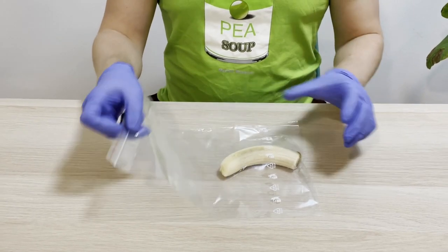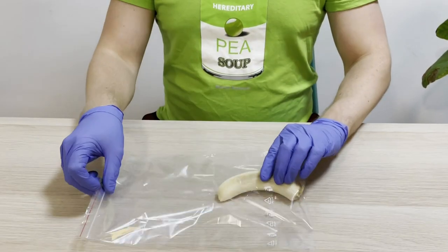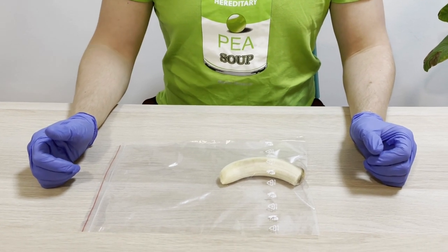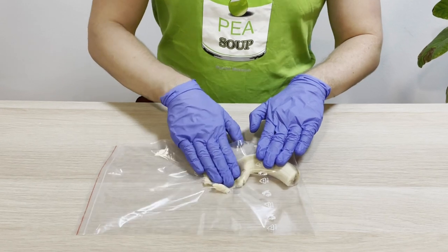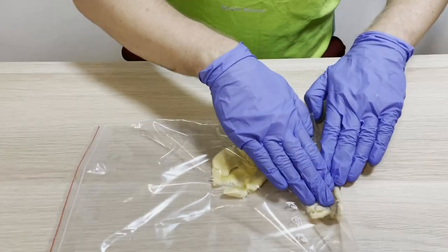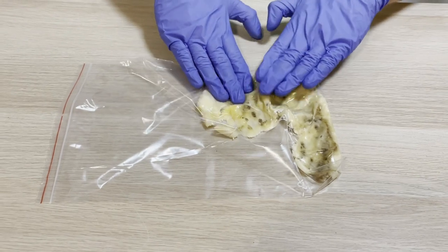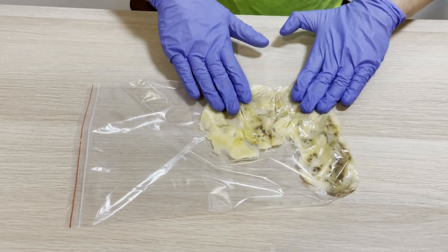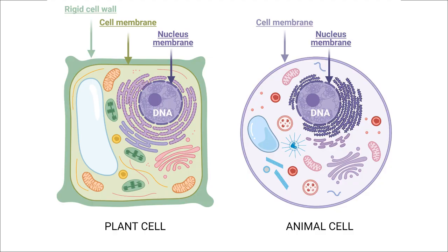Put the banana into a zip bag. Because not all the cells are on the surface, we need to smash it gently and release the cells from inside. Moreover, because plant cells, unlike animal cells, are surrounded by a rigid cell wall, it's important to mechanically damage it and allow the reagents to interact and destroy the cell membrane in later steps.